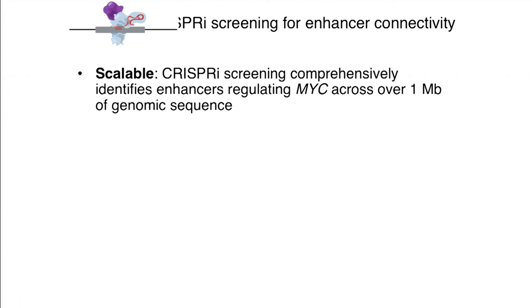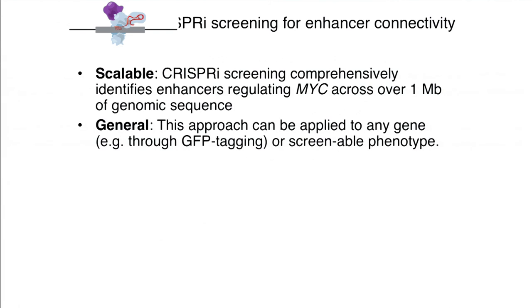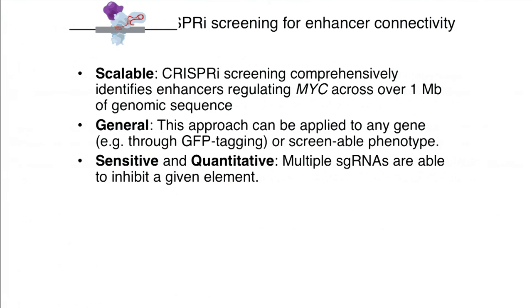And so in conclusion, we found that CRISPR-I screening can be scalable in that we were able to simultaneously assay the regulatory functions of well over a megabase of genomic sequence. This is general in that while we used growth as a phenotype, you can imagine gain or loss of function gene tagged experiments to assay the regulation of an arbitrary gene. And importantly, it is both sensitive and quantitative.